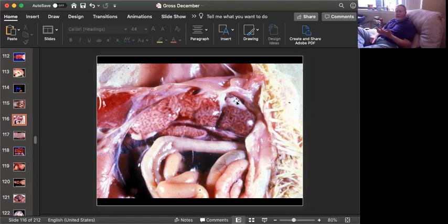So I want you to think about gout, very common in poultry, and every flock has some background level of gout, usually in treated flocks. There's always maybe a 1% because you're always going to have some animals that can't compete for water and they get dehydrated, they get some gout. And then I want you absolutely to think about infectious bronchitis in this particular case. And that's actually what this particular slide is, an old slide back from the 60s, a case of infectious bronchitis affecting the kidneys of a chicken.